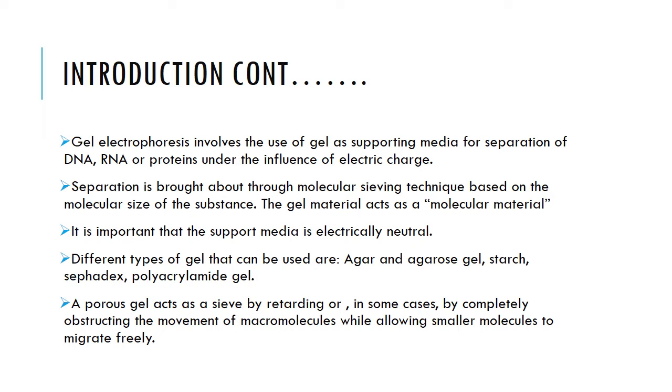It is also important for us to note that the gel is supposed to be neutral. It is not supposed to have any charge. Each and every time we are dealing with a gel, it's supposed to be neutral.